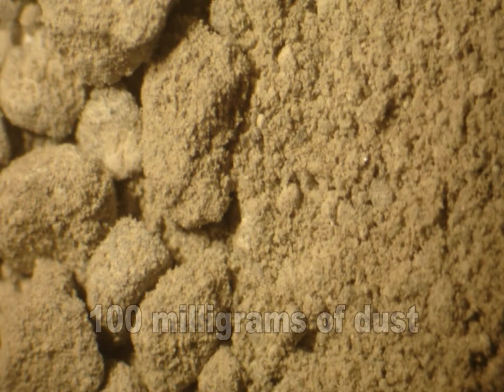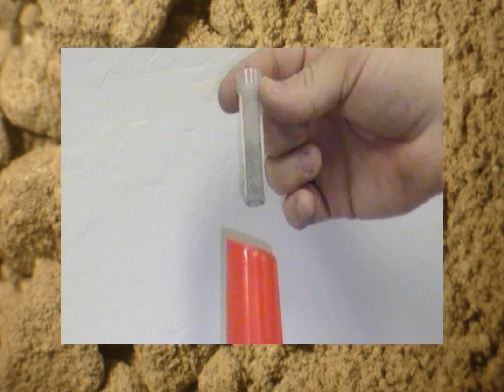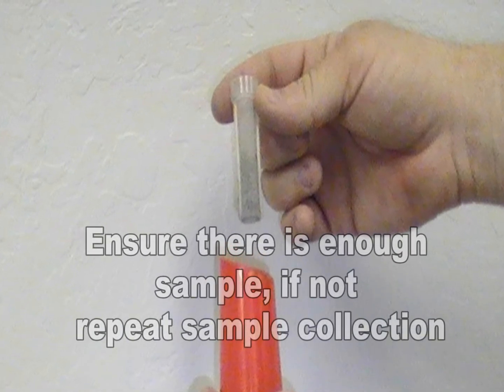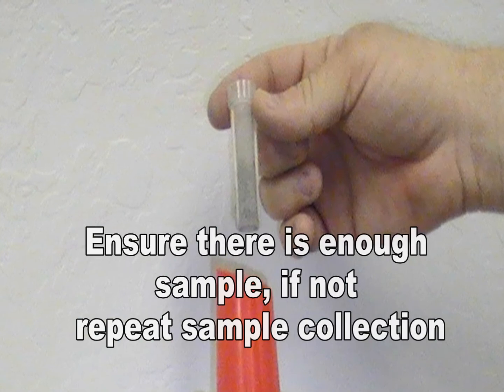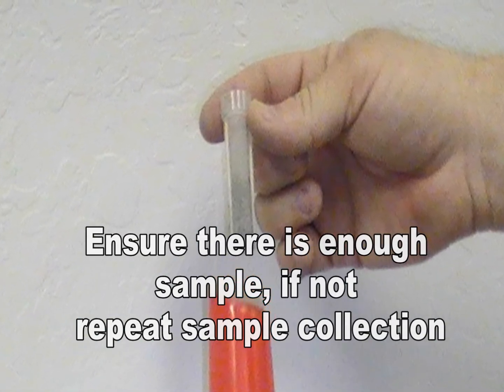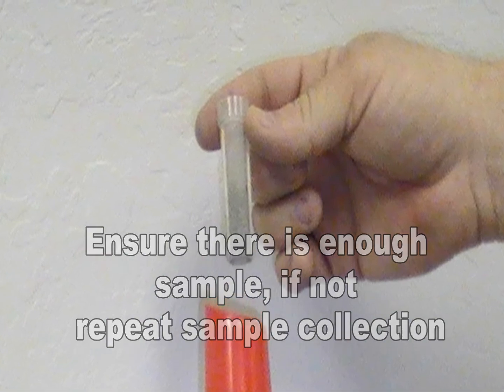A minimum of 100 milligrams of dust is required by the laboratory for the allergen analysis. To check this, remove the cartridge from the hose of the vacuum and push the collector from the bottom to dislodge it from the cartridge. If the collector does not have enough sample, reinsert the collector back into the cartridge and vacuum the suspect areas again.